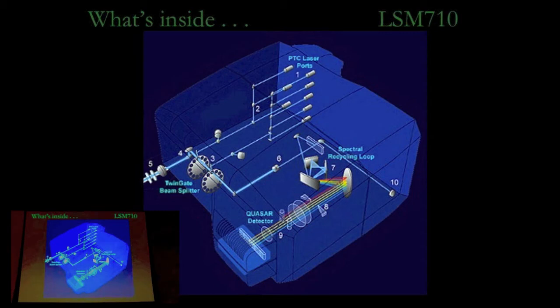Yeah. But sometimes for speed, you want to collect a red and a green at the same time, or a red and a blue at the same time, and in that case, you'd have to pick a compromise pinhole setting. But it's not that big of a deal.